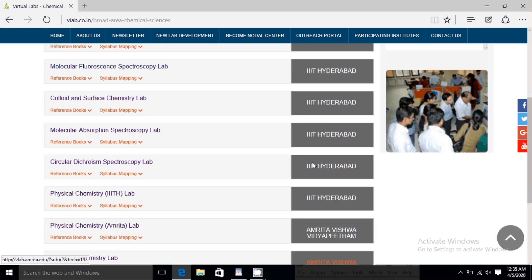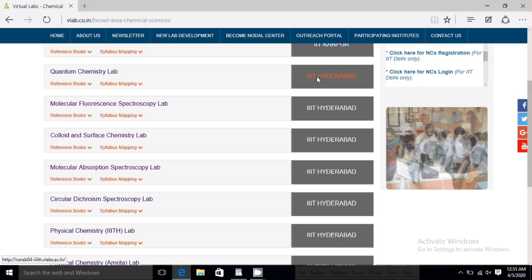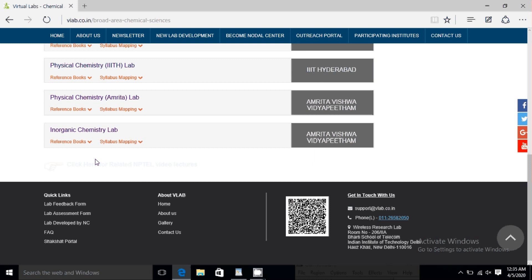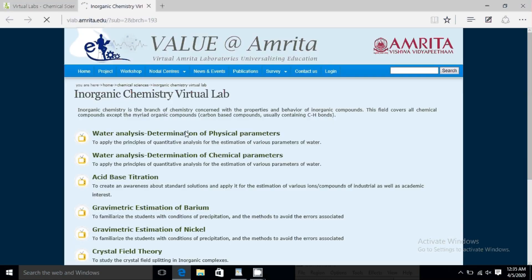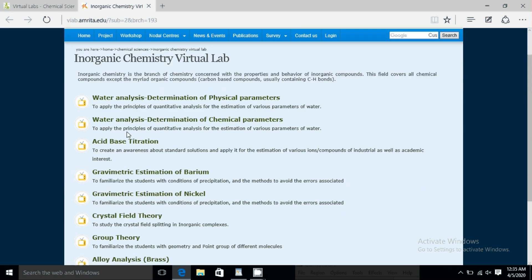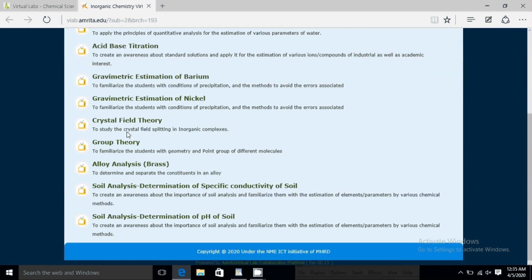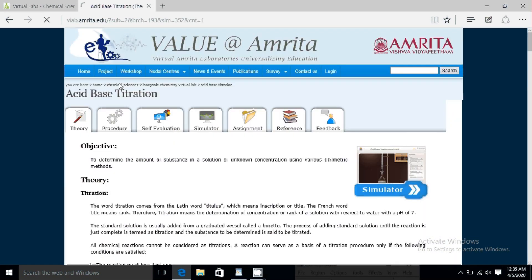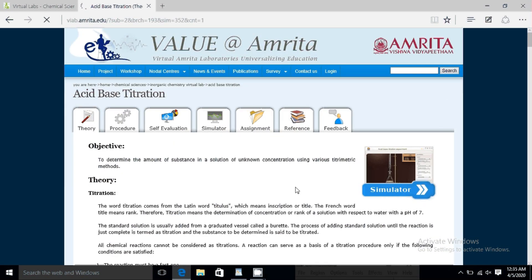I'm not an expert in inorganic chemistry, but I will try to show you how you can conduct your practical. Just click on inorganic chemistry and you will see the different kinds of experiments which are already available. I will just perform an experiment on titration.